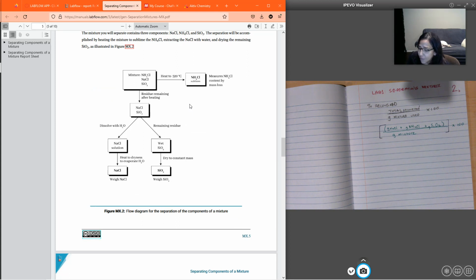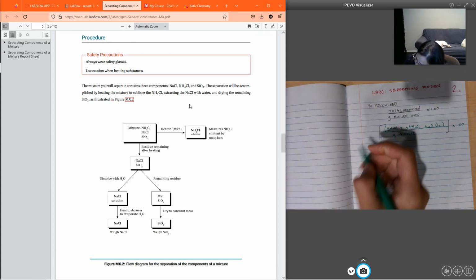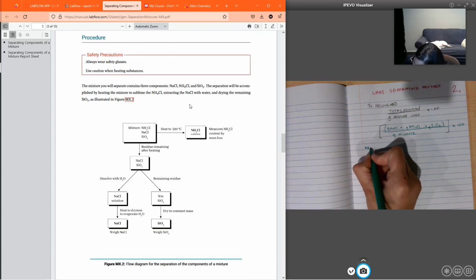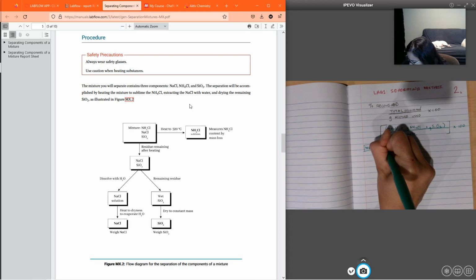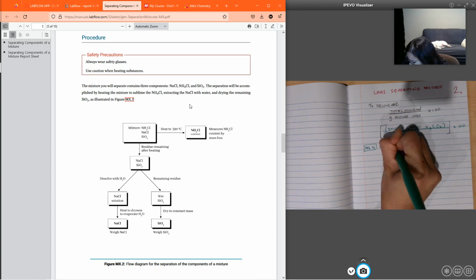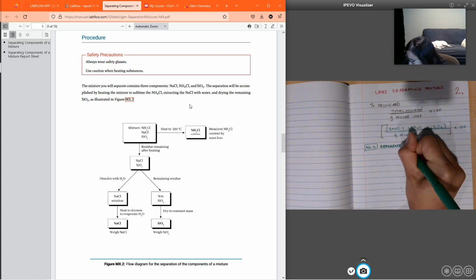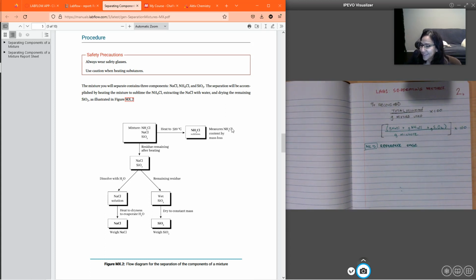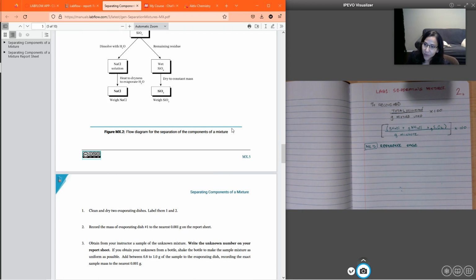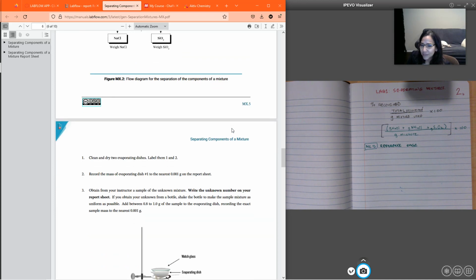It's going to help you. Remember that when you get to that question, and it's like, this one ended up weighing more. What could have happened, right? Or it ended up weighing less.